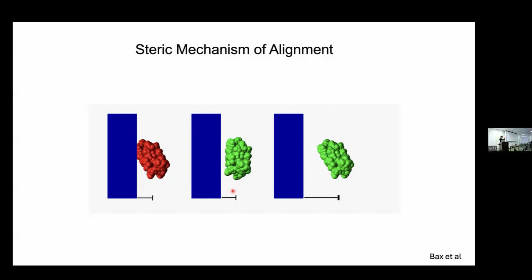All of a sudden now I change the shape of this pen because it's disordered and I created an alternative shape. Now the vector will not enjoy the same coherence, and it's going to have a different distribution of angles. And now all of a sudden you're going to start sampling more of the broader 3cos²θ minus 1, and at some point you get back to zero. So the alignment is based on the anisotropic shape.